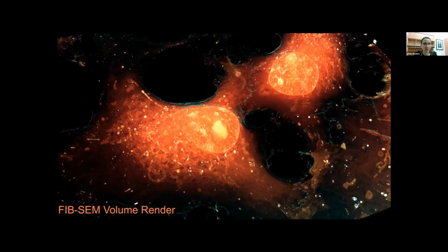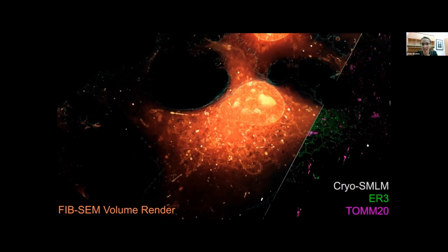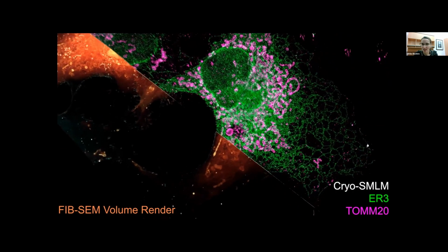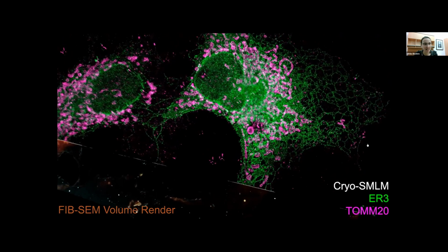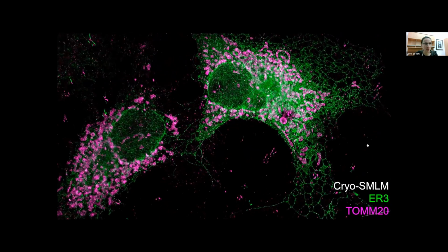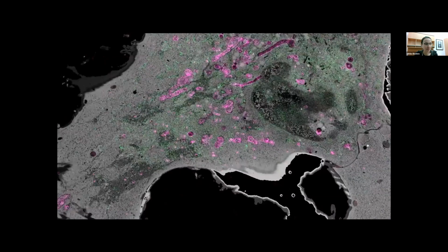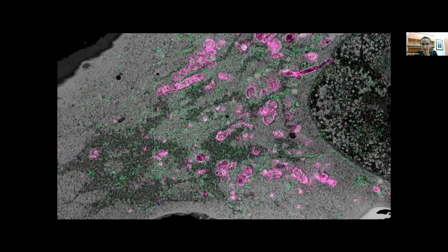That's usually something quite nice, because we all know the advantages of electron microscopy. You actually have a good resolution. You can see things to a very nice extent, but unfortunately things do not really show up in different colors. Therefore we need something which guides us to the regions of interest. They showed this quite beautifully in their work, spearheaded by Gleb Stengel and also David Hoffman, that you can combine cryo super resolution microscopy quite nicely also with electron microscopy.